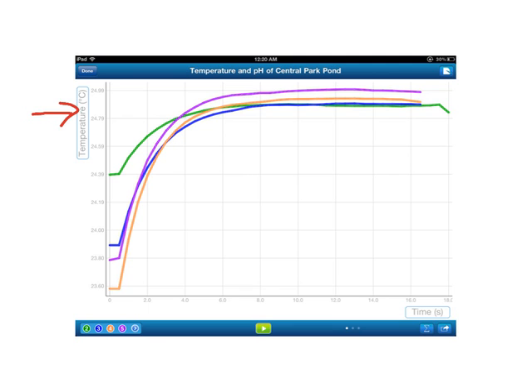And you can do the same thing as with your other parameter. You can also find the summary, and you can also click on the different buttons so that you can see which run you will find the summarized value.